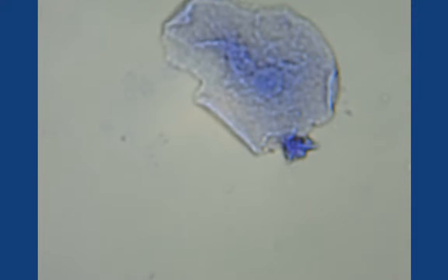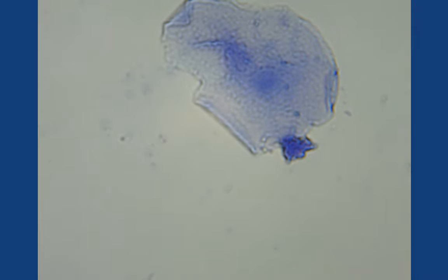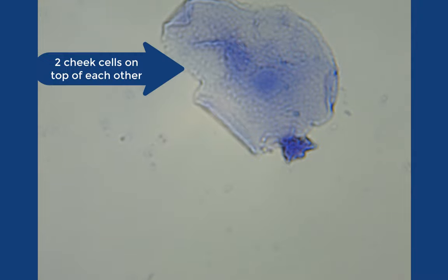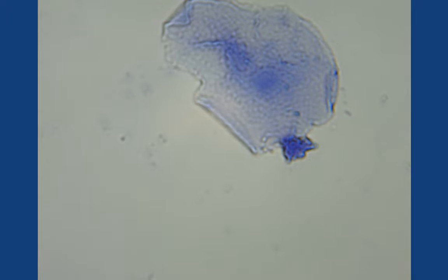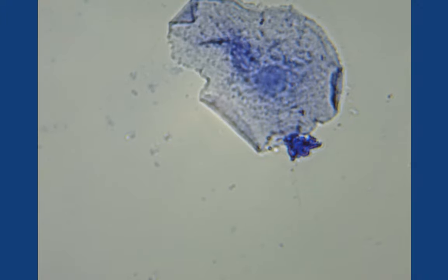Be very gentle with this last step as it is easy to turn the focus knob too much. It should only need to move a tiny little bit to bring the cells into full focus. The round or oval purple shapes are your cheek cells. The darker oval shaped structures inside the cells are nuclei of the cheek cells. The tiny purple structures on top of the cheek cells or next to the cheek cells are the bacteria.